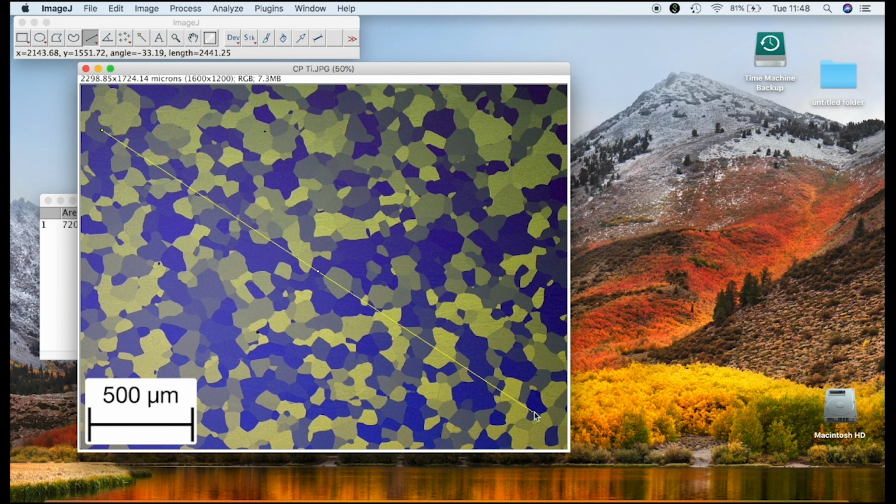This is the same premise as before. This is just an on-screen measuring tool, and it's been calibrated using a set measurement distance, in this case 500 microns. So you can do this with any image you want. And I know people use this software for all sorts of scientific measuring. I think I've seen a report of people measuring small capillaries, or blood capillaries in lungs and stuff like that. Anyway, that's a different subject.